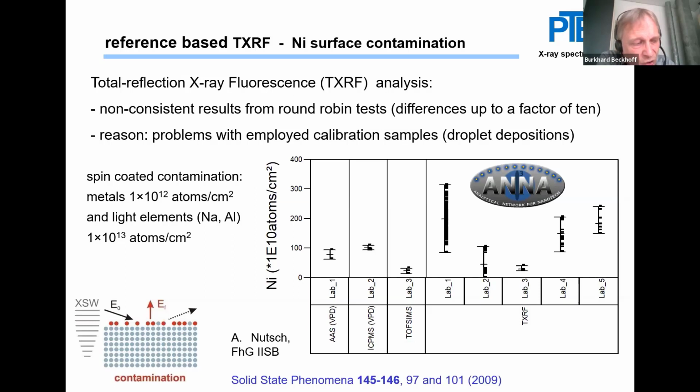And the question for all analytical techniques is, what can be the reason for deviations of, let's say, 1 order of magnitude? In general, one may say that this depends on the reliability of the pre-calibration of the instrument, on the measurement procedure, and on the quantification procedure. But it can also depend on the sample morphology.